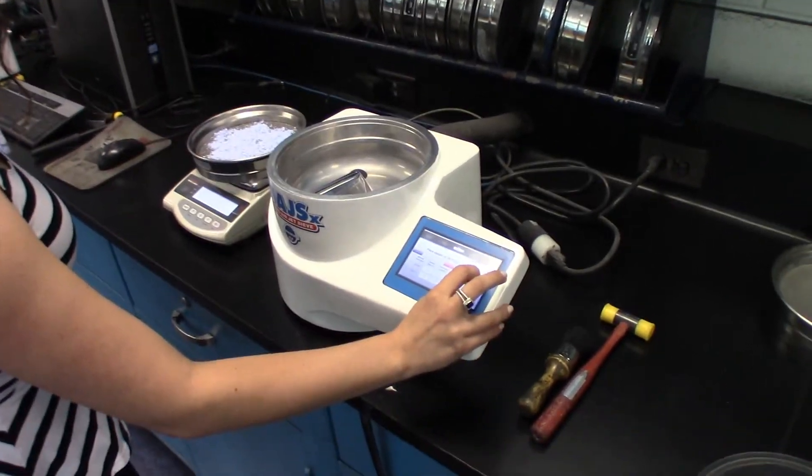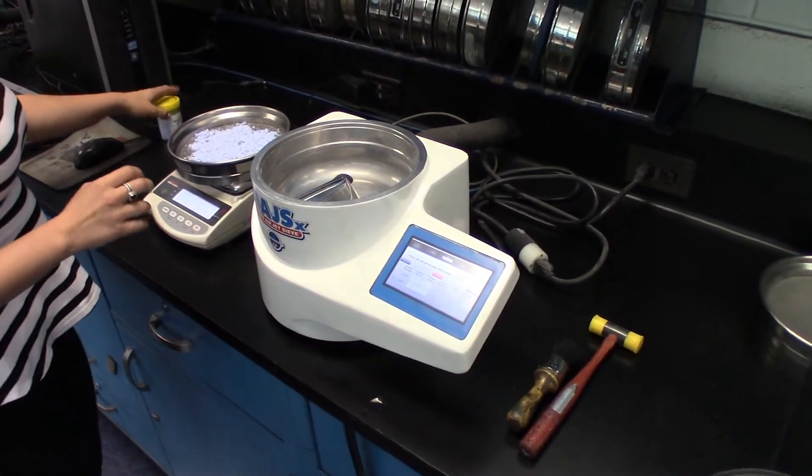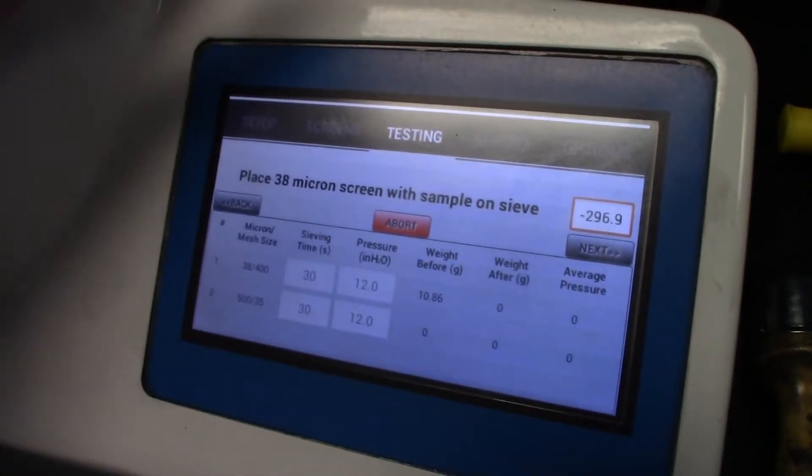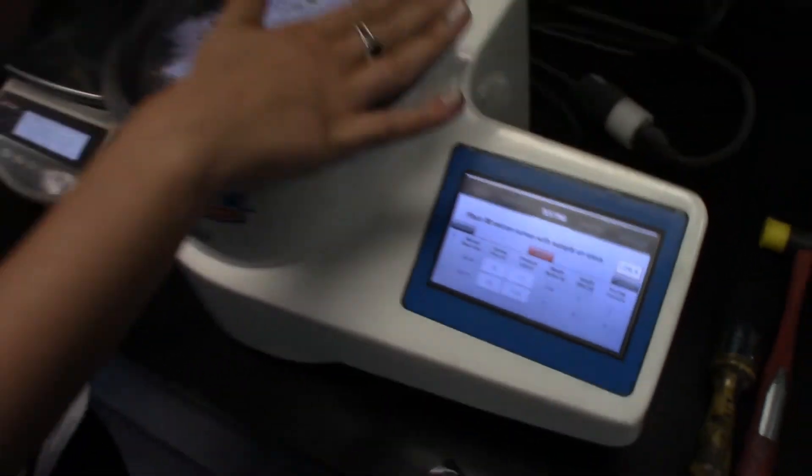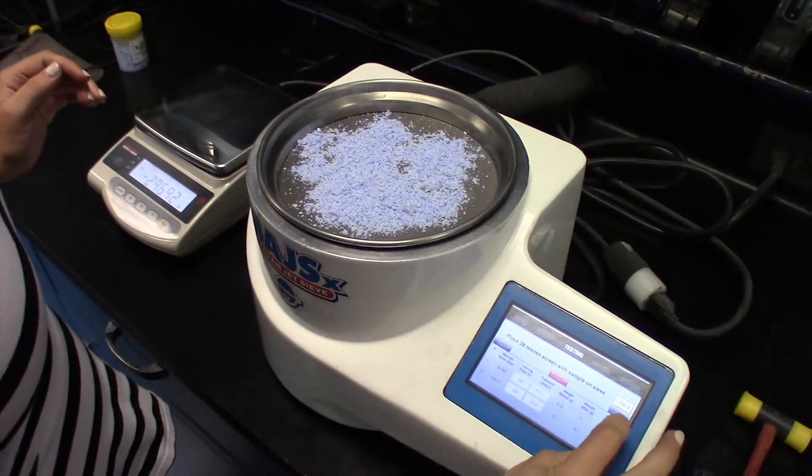Press next on the air jet sieve. You always want to make sure it's sitting down. Press next.